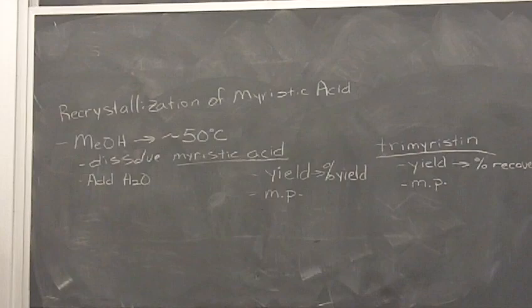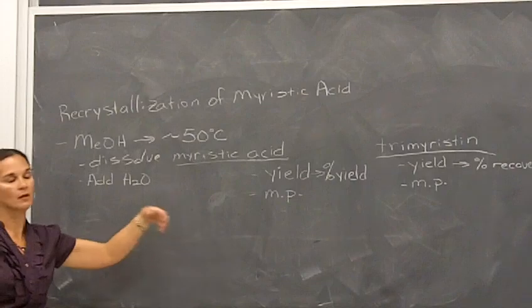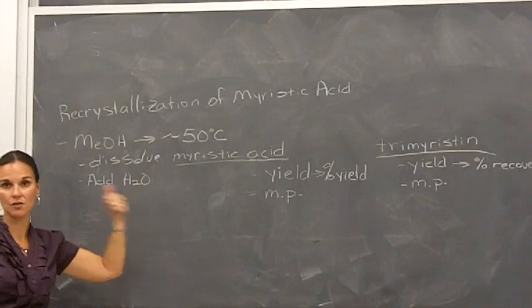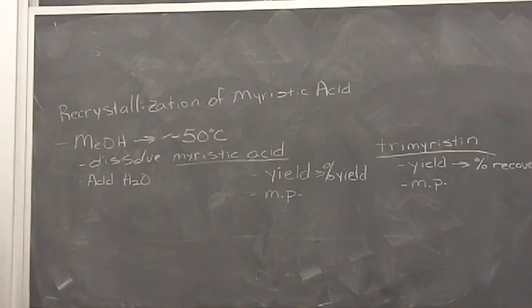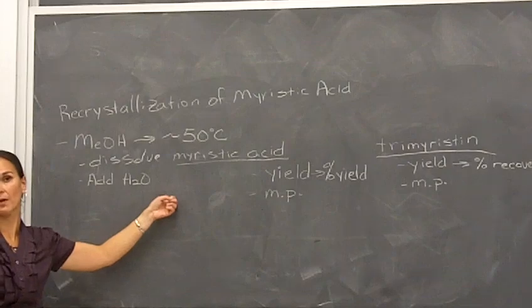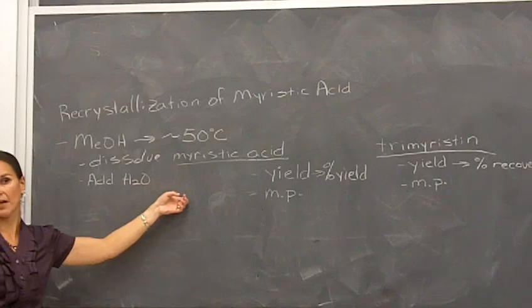And then hang on to these guys, just like experiment 1, you want to hang on to your neutral compound and your acid compound till you get your notebook back from us saying, yes, you're okay, everything checked out okay. Same with these guys. Once you've got the yield and the melting points, don't throw them away. Hang on to them until you get your notebook back with a report for experiment 3 collected, and then you can get rid of them. And these can just be dissolved in acetone into the organic waste, just like your experiment 1 unknowns. Once you get everything graded, they can be dissolved in organic waste with acetone. Okay?